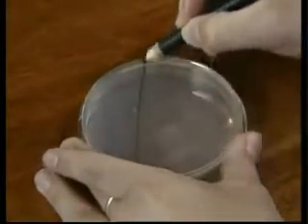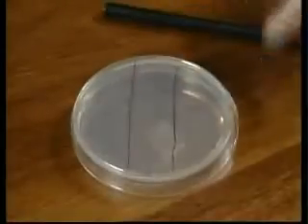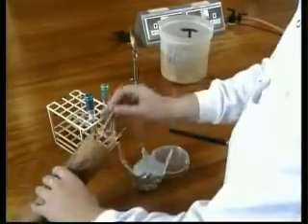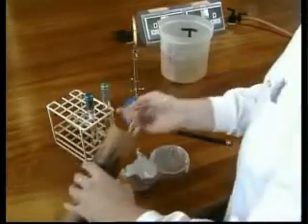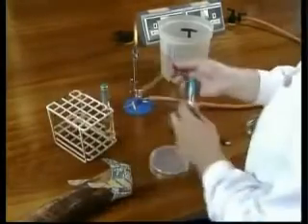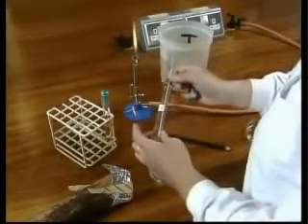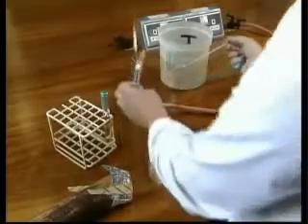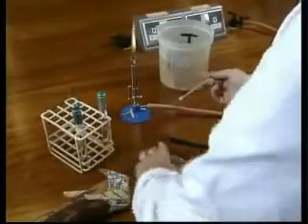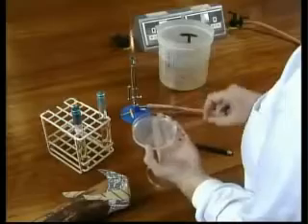The test plate is divided into 3 sections. Control strain is inoculated in the centre section.